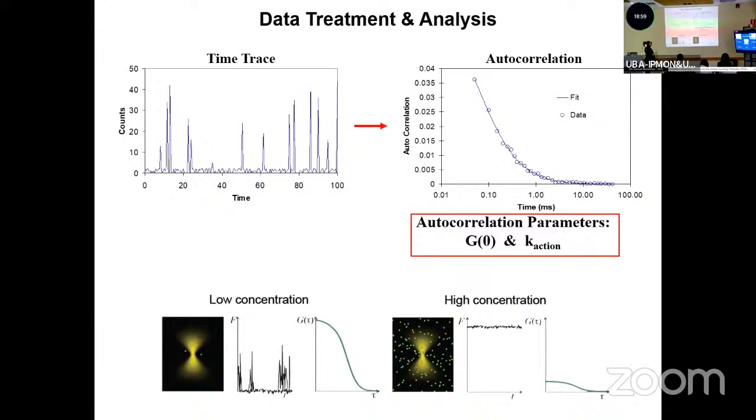So now that we talked about the laser and the point spread function, we're going to go to looking at the molecules. All right, so what do we see here? We have 2 different concentrations, low concentration and high concentration of molecules. And under the low concentration condition, very few molecules can transit the beam, right? In this case, I'm only showing 2 molecules, but that's fine.